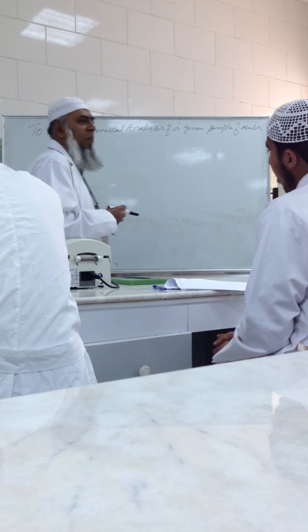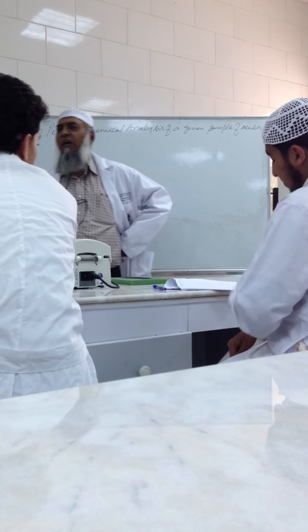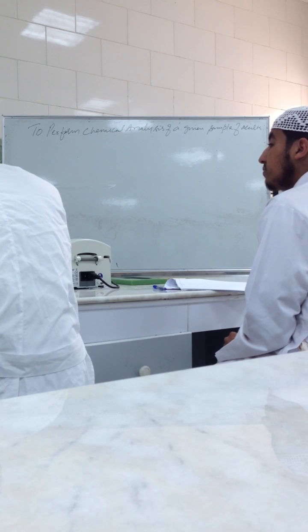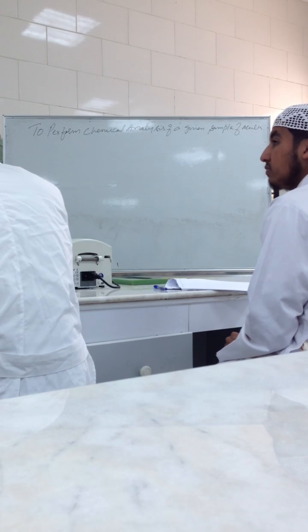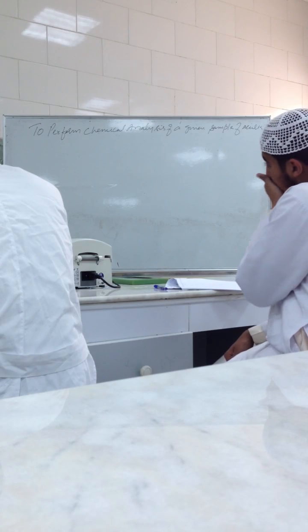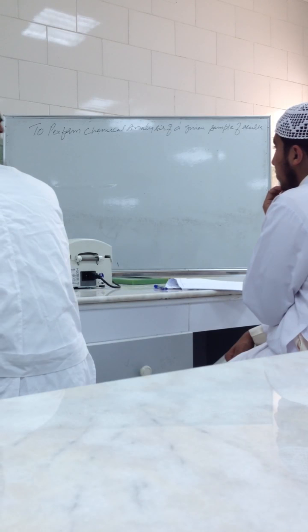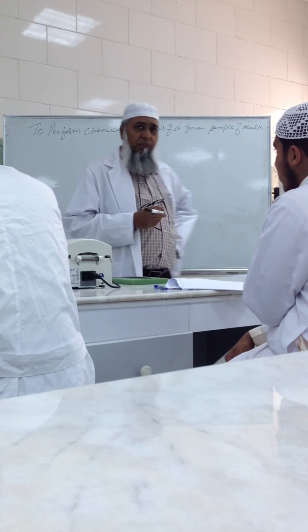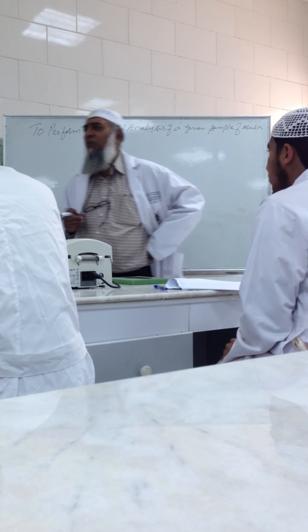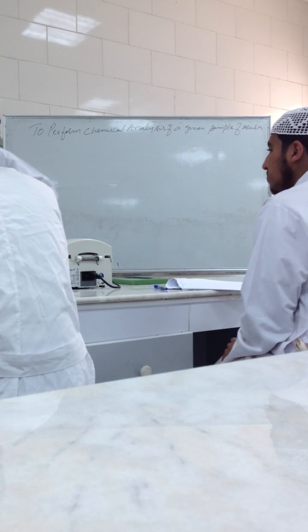And number two, how to analyze the presence of glucose or disaccharides in the milk, and how to check the presence of proteins in the milk. And then in the next session we will go through other substances.